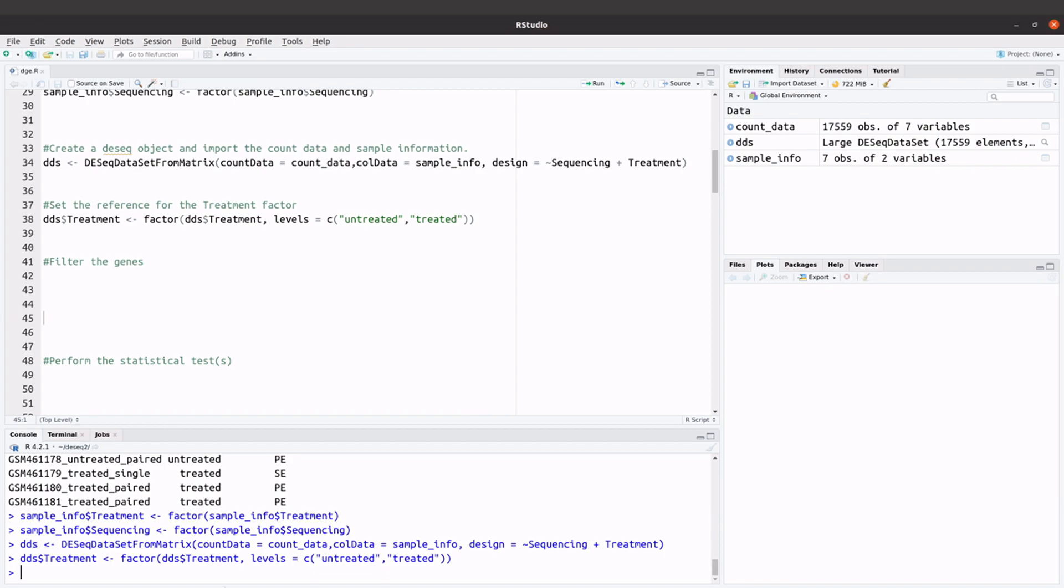So that's what we are going to do. We are going to keep only genes which read counts greater equals to 5. So this is what we are going to do. We will first get this expression keep.